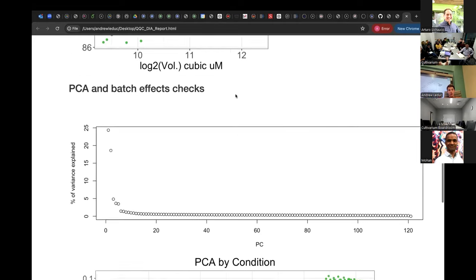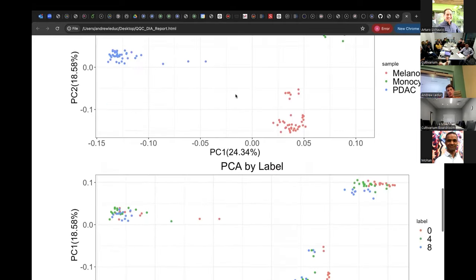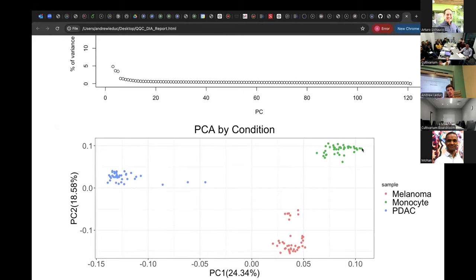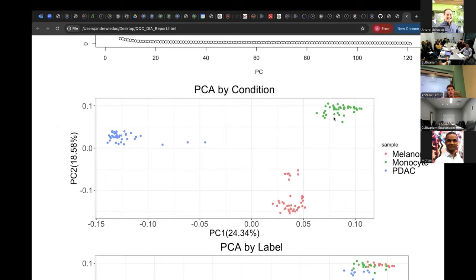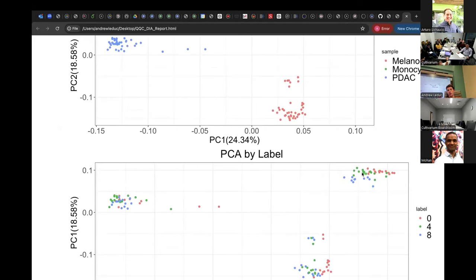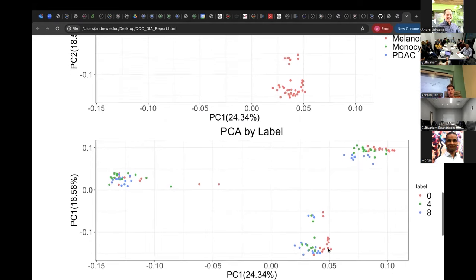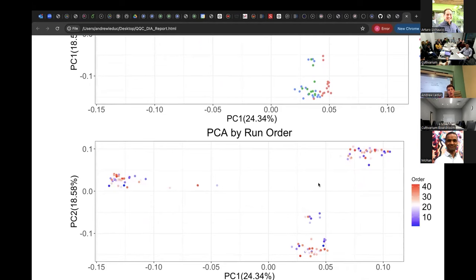We can look at principal component analysis. It can visualize the principal component analysis by different things that might cause batch effects. I didn't do any batch correction here. You can see maybe there's some variability within the monocytes, or I think I actually mislabeled this when I ran. You can see there's a bit of variability. We also can apply a batch correction on the individual labels, which you might want to do. Also, by the run order, you want to check this.